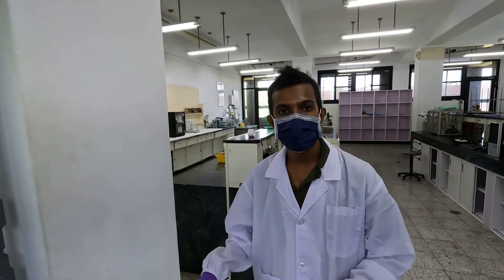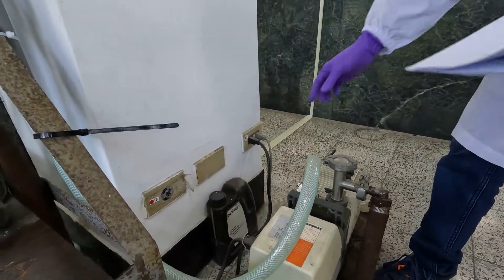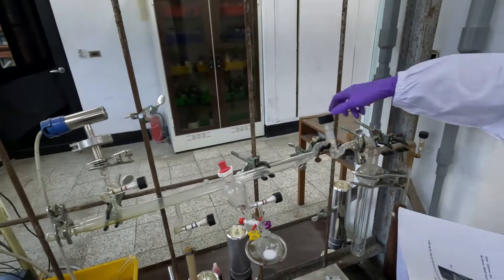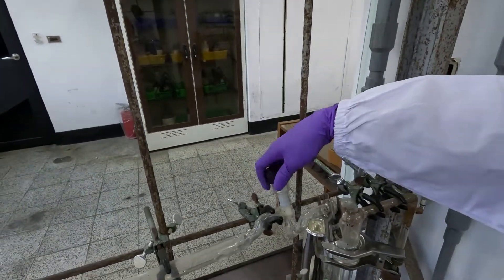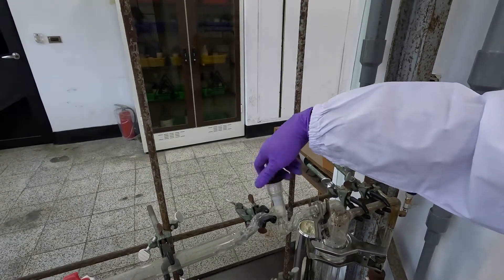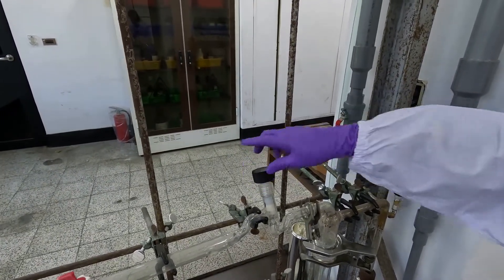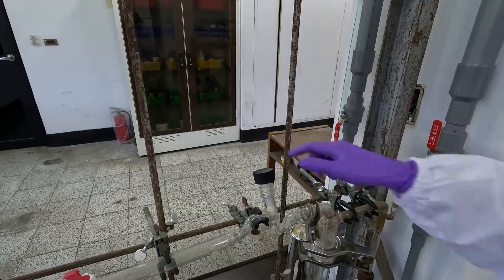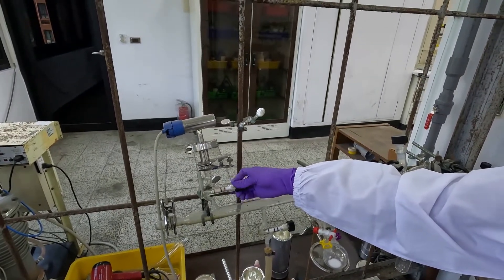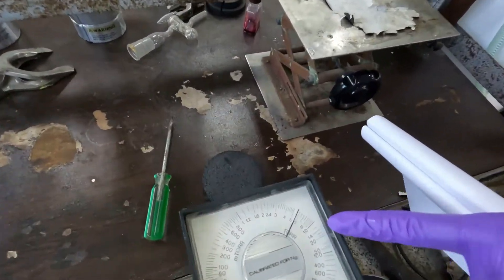The next step is to turn on the pump. After that, you can sequentially turn on valve A and valve E. Make sure not to exceed this line. When you turn on valve E, you can see in the gauge that the pressure is decreasing.